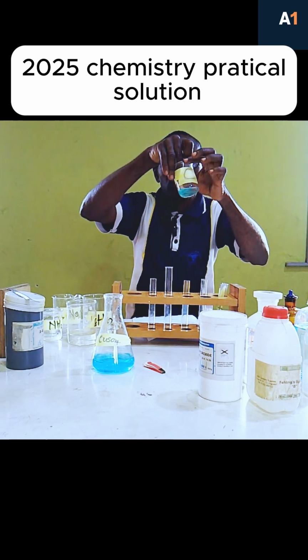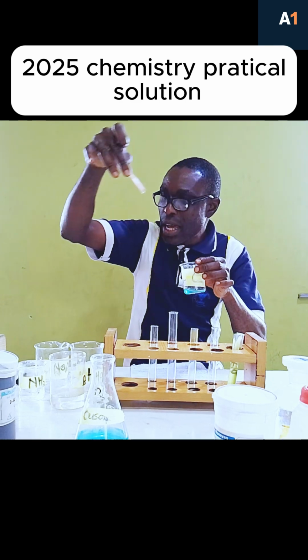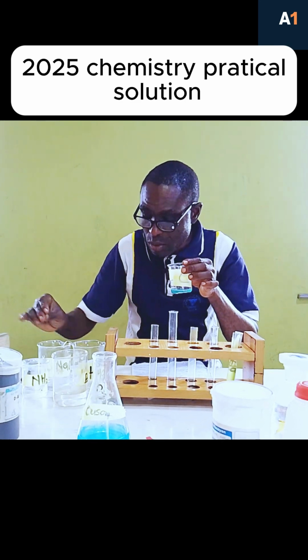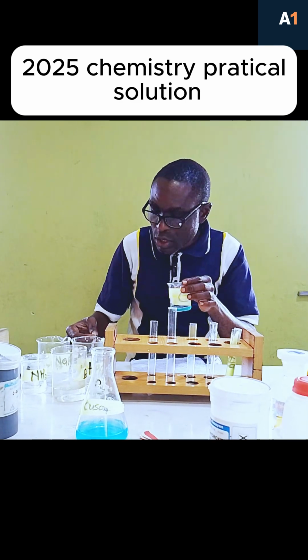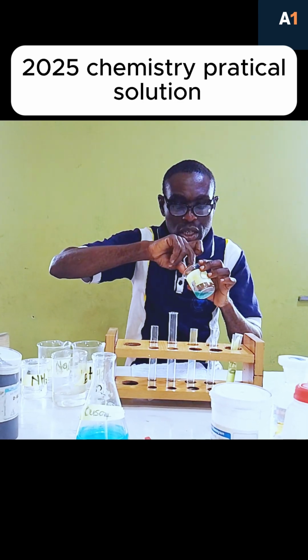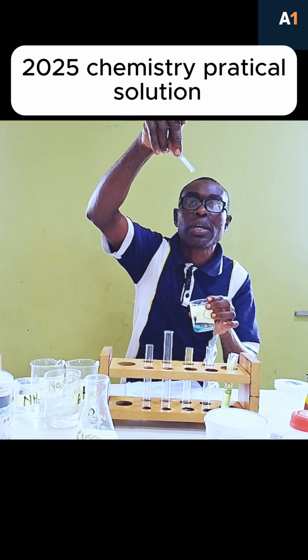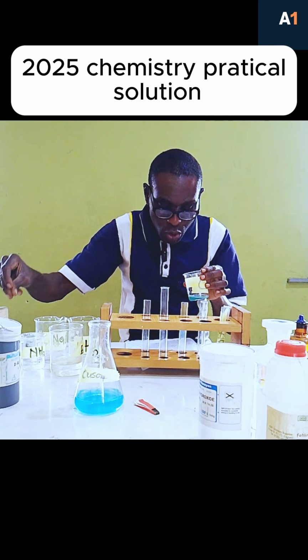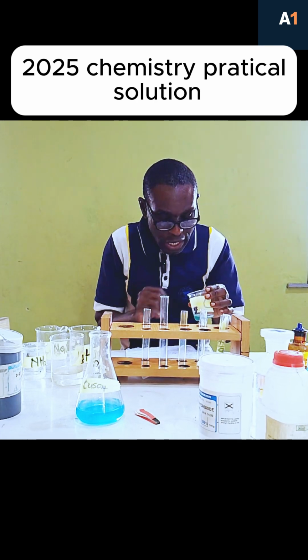Let's see. Do you observe anything? No. Meaning that there's no reaction with red litmus paper. So let's now test the blue litmus paper. Do you observe anything? No chemical reaction. So that confirms what we wrote on the board: there's no visible reaction with that.